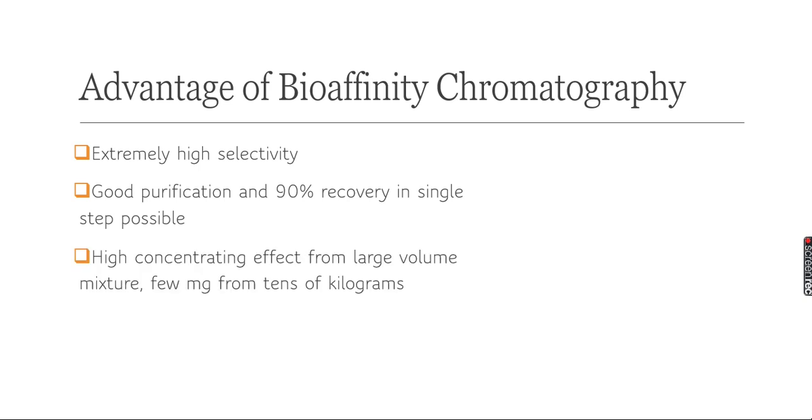Another advantage is the high concentration effect from a large volume mixture. For example, if I have some 40-50 kilograms of mixture containing some milligrams of the target compound, that can also be recovered effectively. So we can concentrate the material significantly, and we can also remove the unwanted material very effectively, because if we retain only the target compound, the unwanted materials can easily be removed. So either way we can do it, purification of our target compound or removal of the unwanted compound. Essentially it is the same.